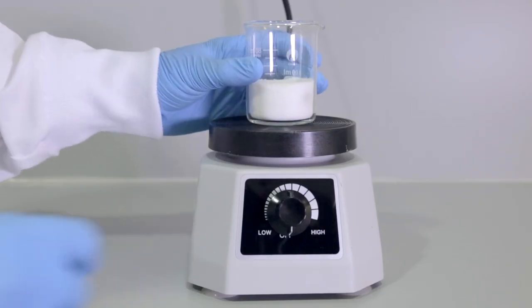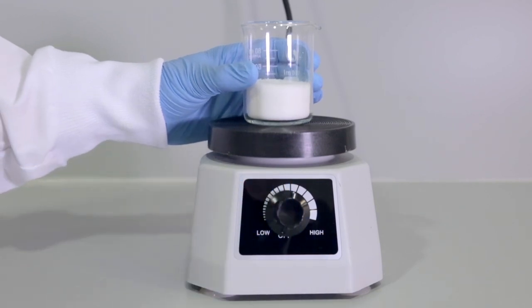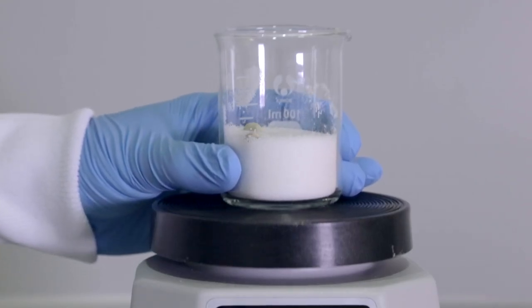Since we started in the business of powder characterization, segregation has always been a problem. Particles reorganizing themselves on the basis of their size differences or their density differences can cause major processing issues and quality problems with finished products. This is typical across many industries, but the pharmaceutical industry where small particles of active drug ingredient are very sensitive to the effects of segregation. Here we can see in this experiment two component materials with different particle sizes.